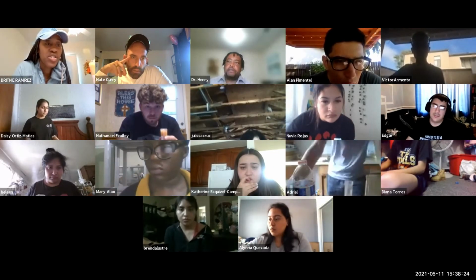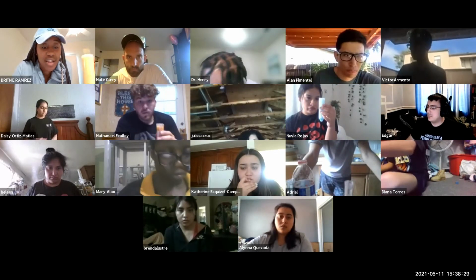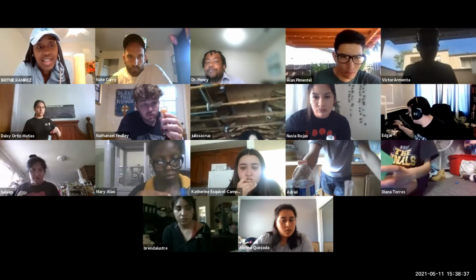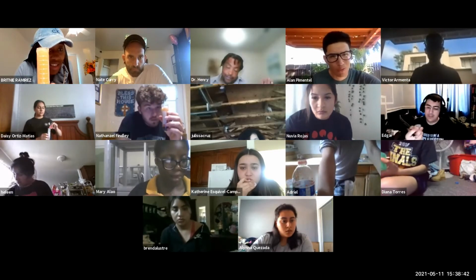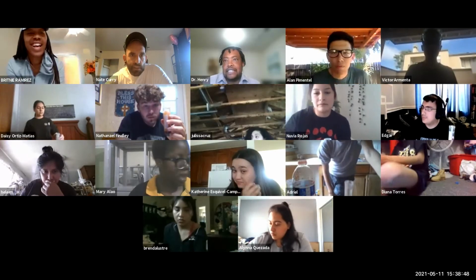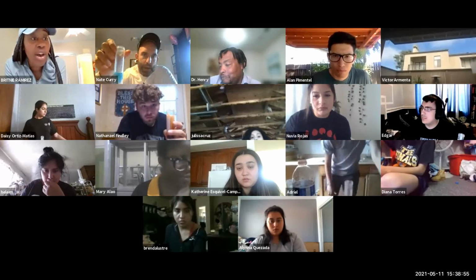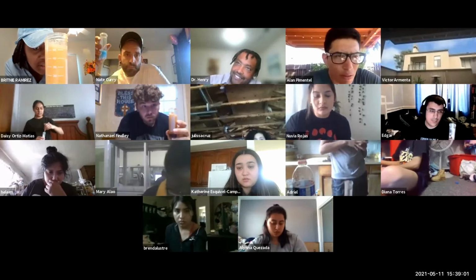What if it was just exactly the top? Can I just count it as the 50? Mine went exactly to the top, so can I just count it as the 50? No, because then you have to confirm that it's actually 50. I'm confirming it right now. That's what happened to mine. But you settled at that, Brittany? Wait, did it settle at that, or did it go over and then drop down some? No, mine went just to the top and it settled right at 45. Right at 45?